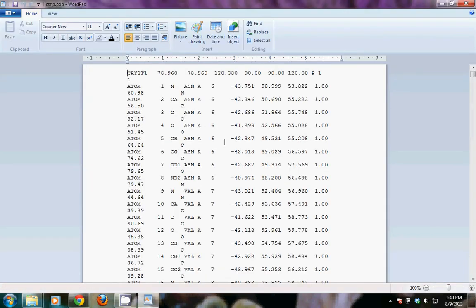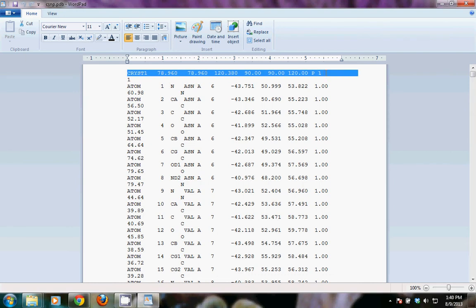One thing that we see right away is that this file begins with the crystallographic information. None of the header was kept by VMD. One thing that could cause is some of the secondary structure helices and beta sheets may disappear in molecular modeling software packages.